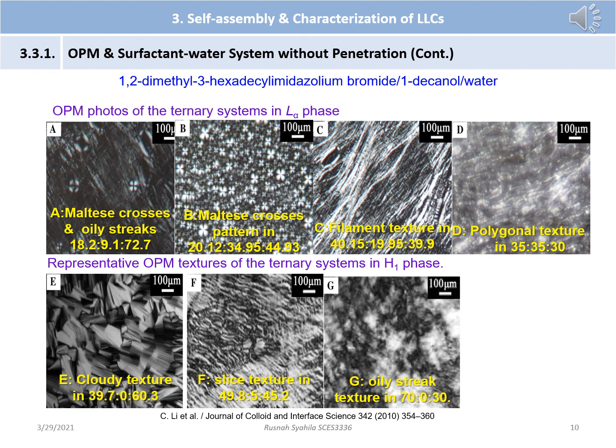The bottom pictures are examples of variation of hexagonal phase viewed under the optical polarizing microscope. Although the only clear texture of hexagonal is shown in E, the other two show more birefringence compared to the lamellar phase.